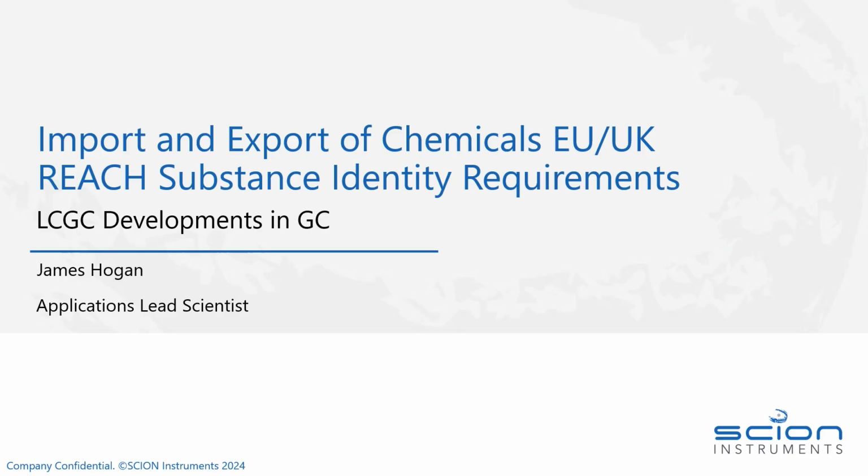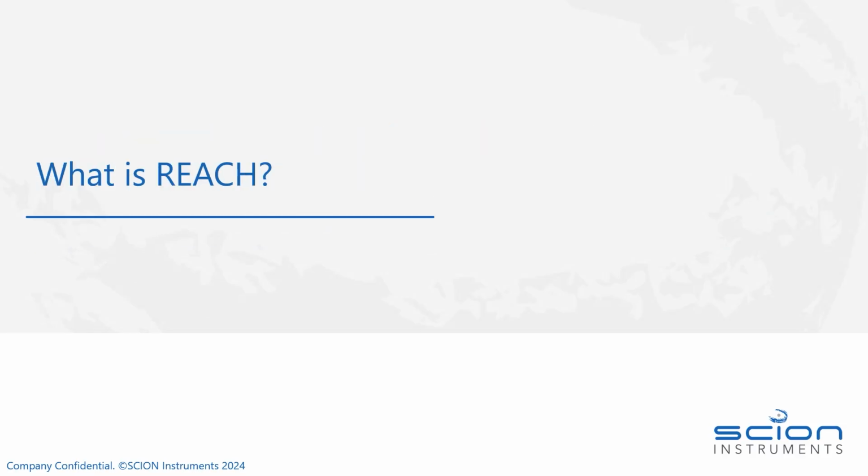Today's webinar is the Import and Export of Chemicals EU-UK REACH Substance Identity Requirements. In this webinar we will focus on what REACH is and what it covers, what it's responsible for, and we will also focus on gas chromatography and how it can be utilised for a vast array of substances to help meet these regulatory requirements. So now to kick off the webinar properly, we will start with the topic of what is REACH.